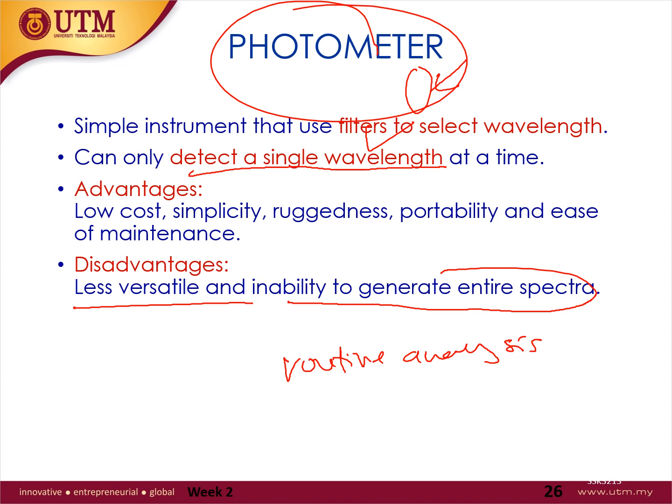Okay, so in this case, you as a chemist later, if you are asked by your boss which one should I use or which one should I buy, you have to understand the whole thing and be able to explain to your superior or colleague which one to use according to your cost and also throughput. Throughput means berapa banyak analysis you nak buat.